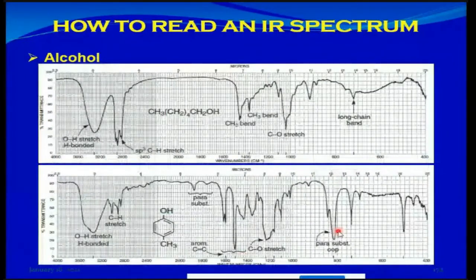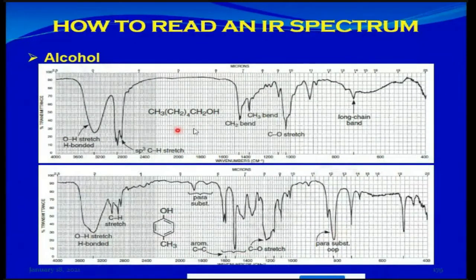Okay, so here we have a couple of spectra. The first one is an aliphatic normal alcohol जिसमें कोई डबल बॉन्ड नहीं है. It's a straight chain जिसके साथ अल्कोहल एक एंड पे अटैच है, और यहाँ आप देख सकते हैं इसका एक broad signal for the OH stretch around 3300 per centimeter, or that shows it's a hydrogen bonded OH stretch. Additionally, you can see here around 1000 per centimeter you have this CO stretching vibration.